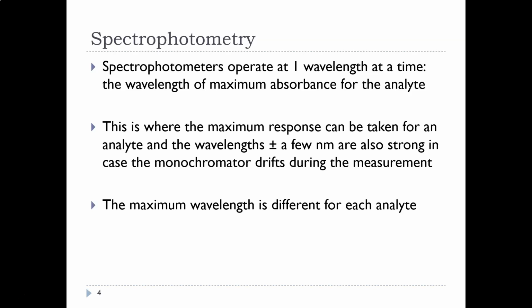it's different for every chemical, for every molecule, and technically it should be determined with every instrument at every temperature, pretty much every day. We want to make sure the conditions are consistent between what we choose to do and when we actually do the experiment. But we can't say, oh, we always test them at 510. No, you might always test iron at 510 nanometers on this instrument in this lab room. That's fair. But if I wanted to test chromium, that's a different wavelength.